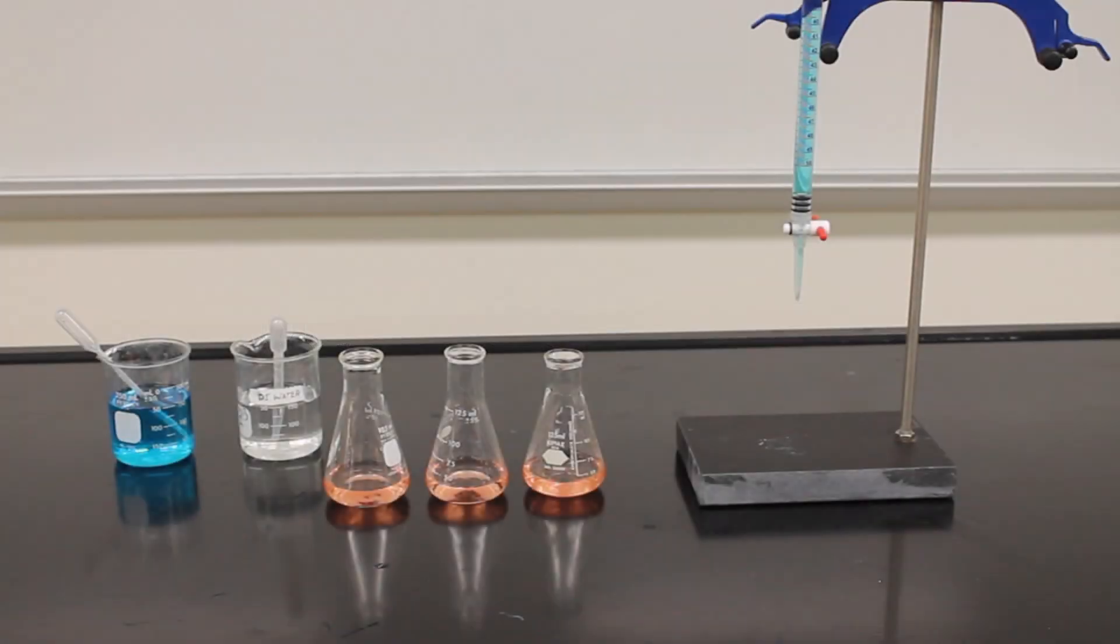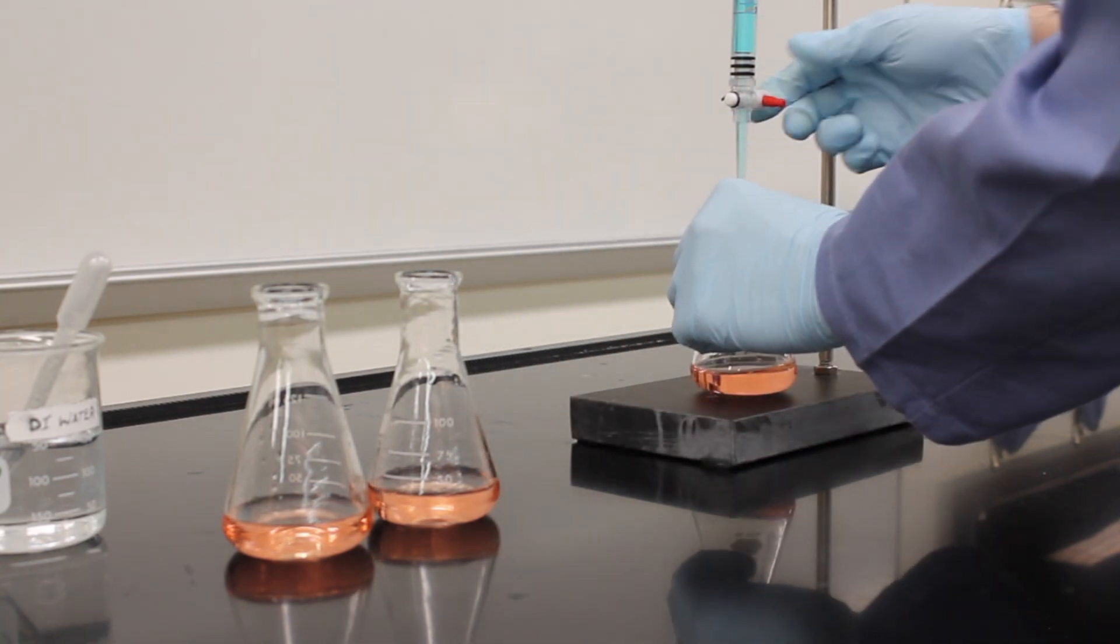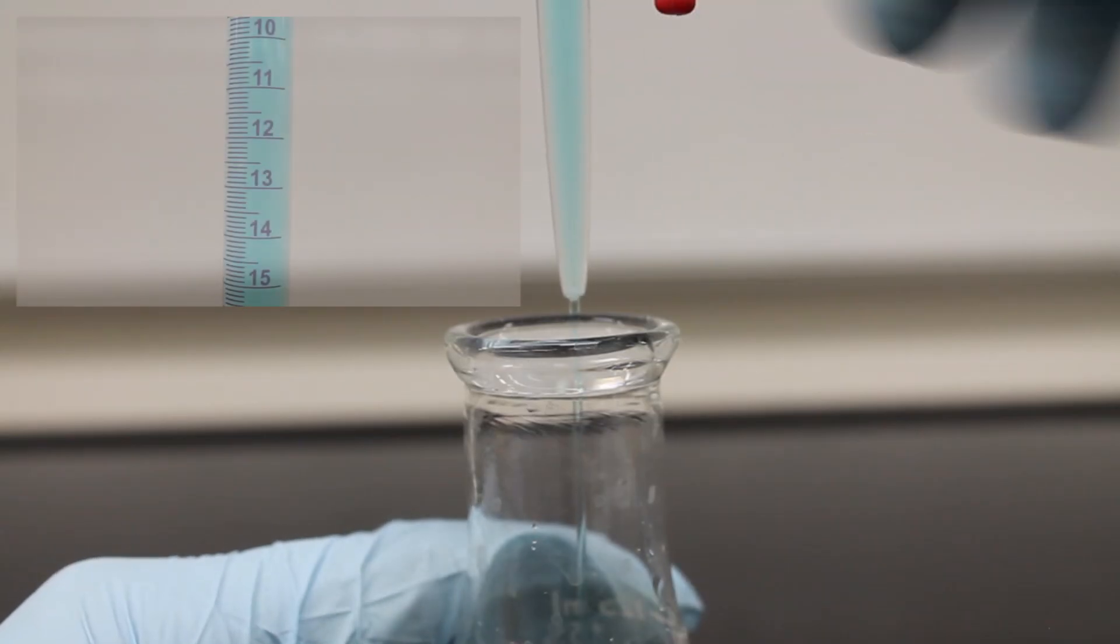Cleaning the burette is really the complicated part. Measuring liquids with the burette is the easy part. Place the container you wish to deliver your liquid to underneath the burette. Open the stopcock and allow the liquid to run.